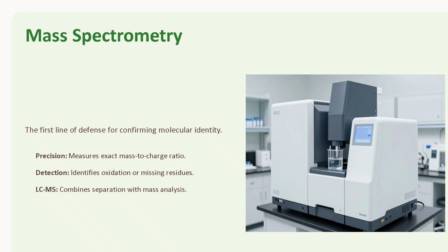A commonly used approach is LC-MS, which combines liquid chromatography with mass spectrometry. This combination allows the peptide to first be separated and then precisely analyzed, providing highly accurate identification and structural confirmation.